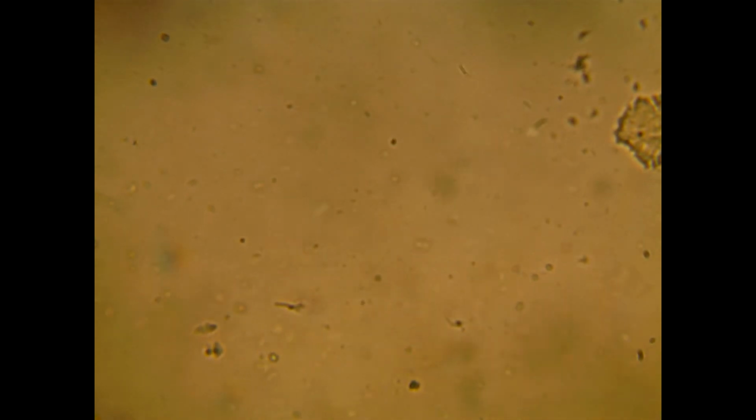You can see some little bit bigger ones up there in the upper right. You can see a guy there below that, a little bit below that particle of soil, that big brown particle there. And you see some others moving around.